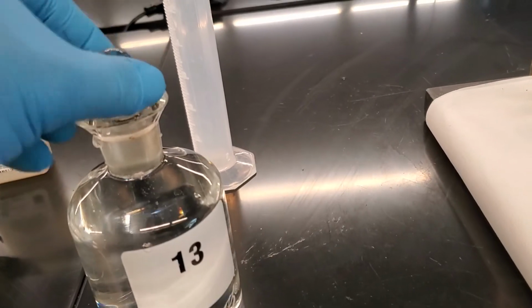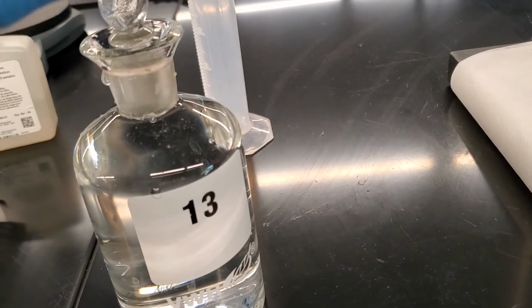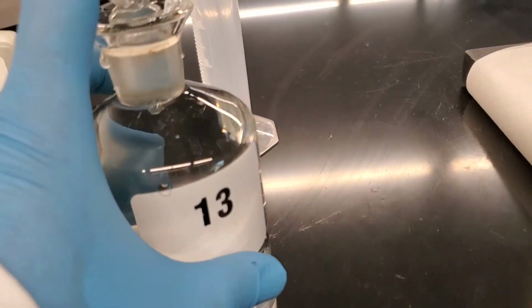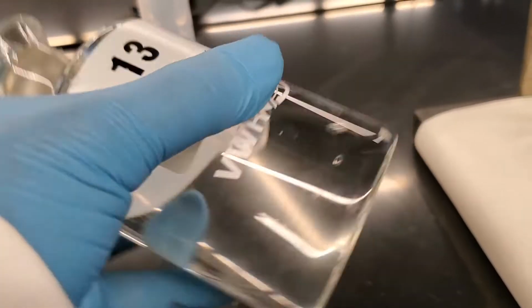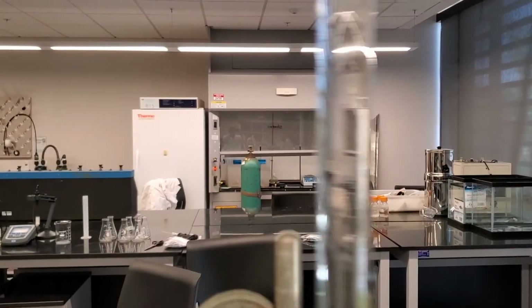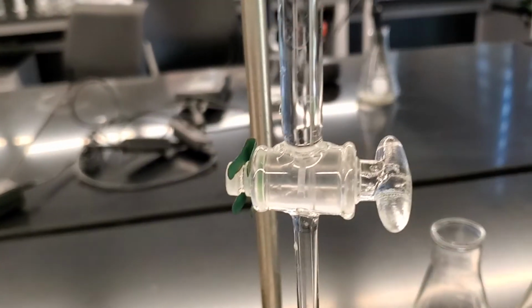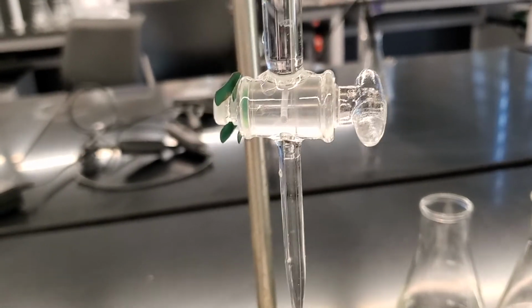If you see this one, it's all filled all the way to the top. There is no air bubble, and this in a way locks your sample where it doesn't flow out. And I have a liquid filled in here, sodium thiosulfate, 0.02 normal. We are going to use this to titrate to find out the dissolved oxygen.